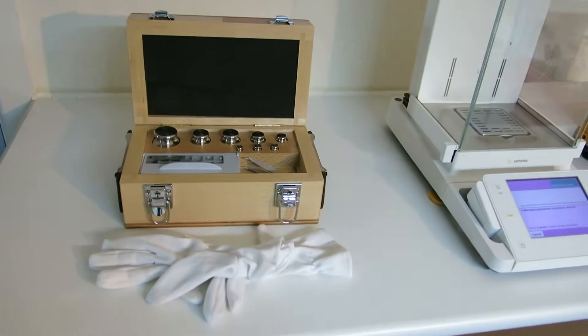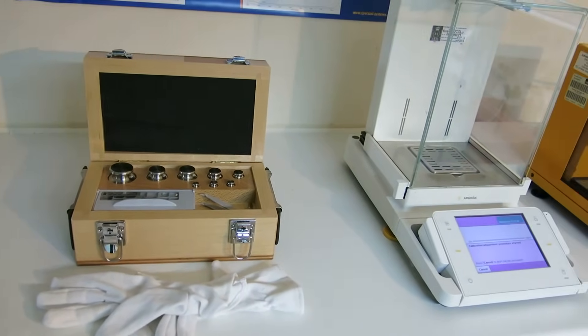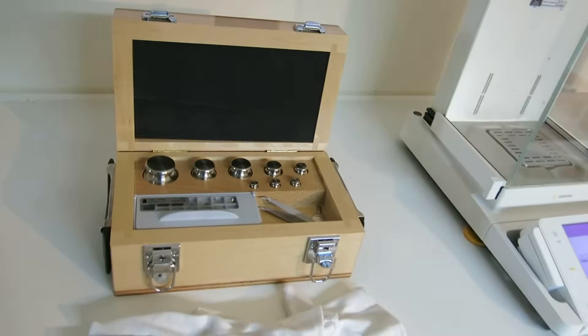This is Richmond Scientific. This is an intro to new unused balancers we've got in currently. We also sell Hafner weights.